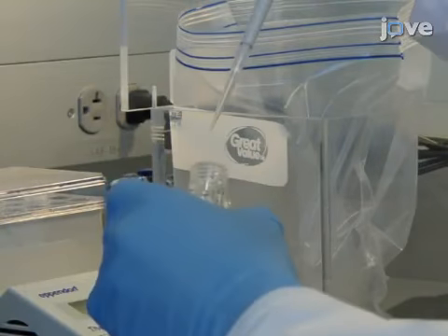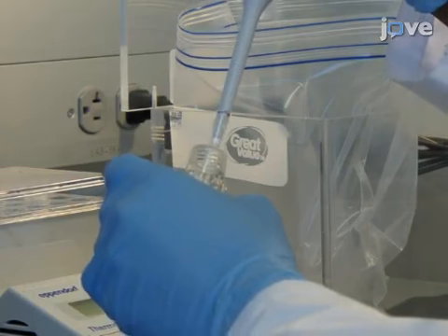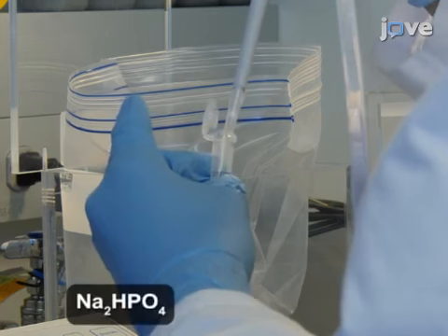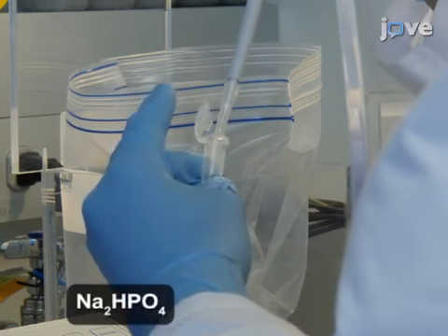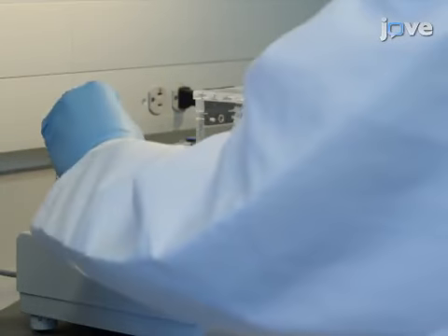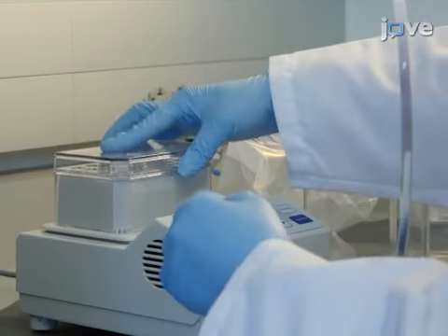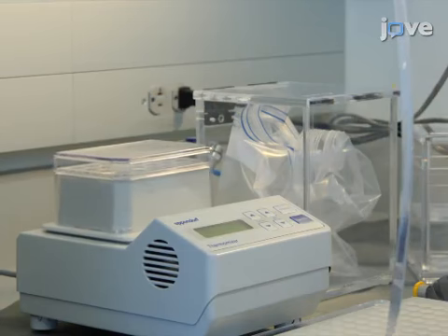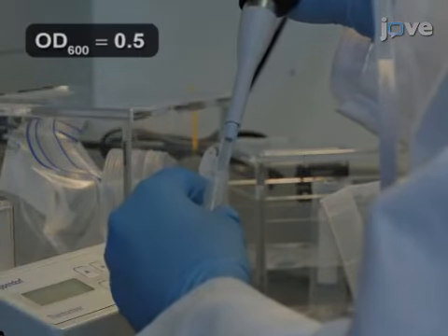Following standard radio protection practices, spike the culture medium with 20 microcuries per milliliter of phosphorus-32 labeled orthophosphate. Grow bacteria at 37 degrees Celsius and 1200 RPM in a shaker incubator placed behind a 9-millimeter thick acrylic shield. At mid-log phase, transfer the entire culture into a 2-milliliter tube.